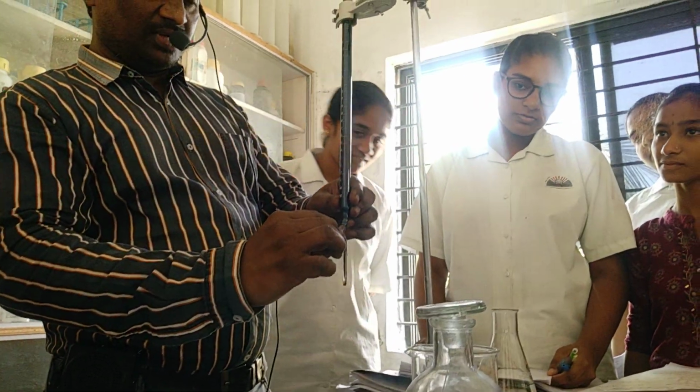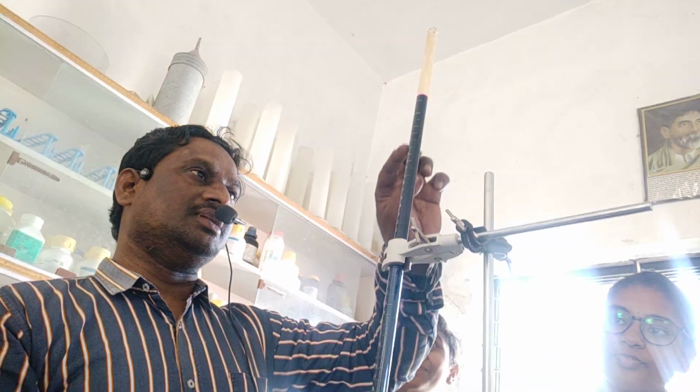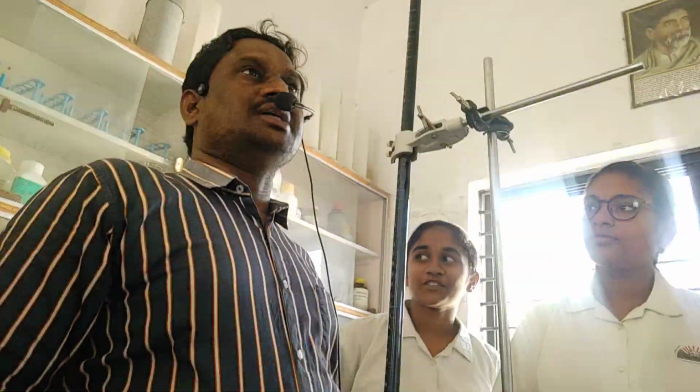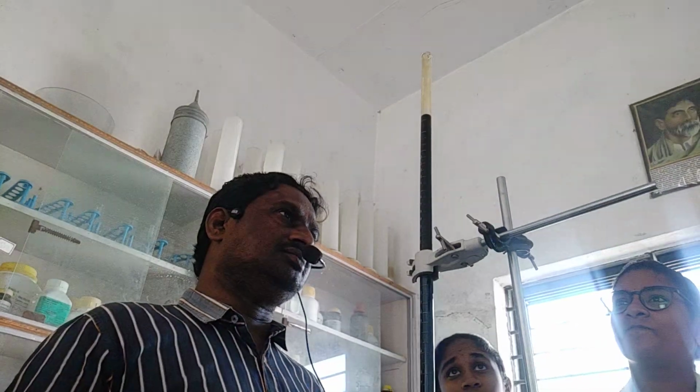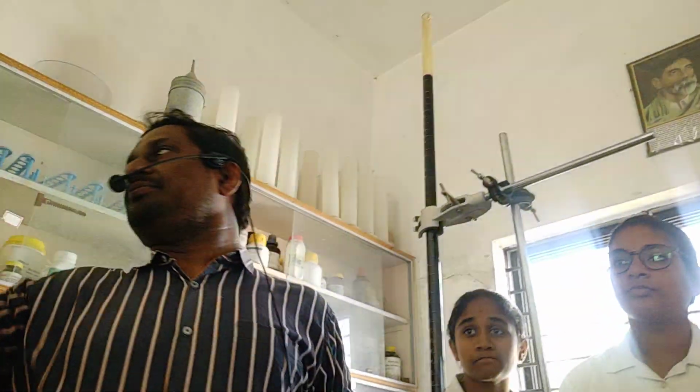So if you release this one, inside this burette KMnO4 is there. What we call this one? KMnO4, potassium permanganate. So this potassium permanganate will be filled and given to you. Okay? So there potassium permanganate is there.